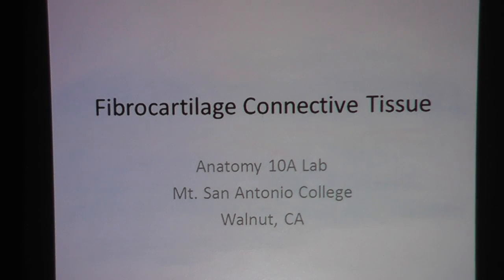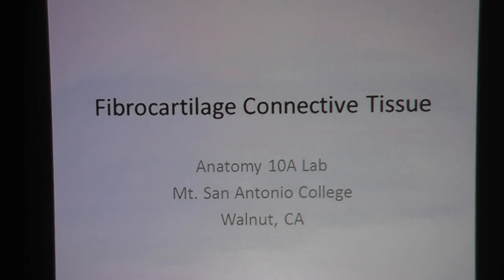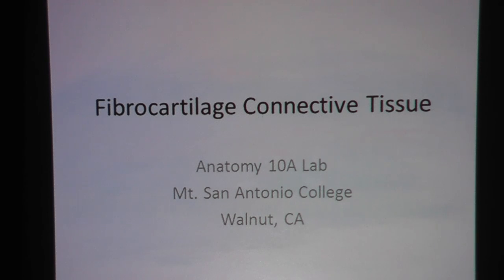Fibrocartilage connective tissue. These slides are made for Anatomy 10A lab at Mount San Antonio College.